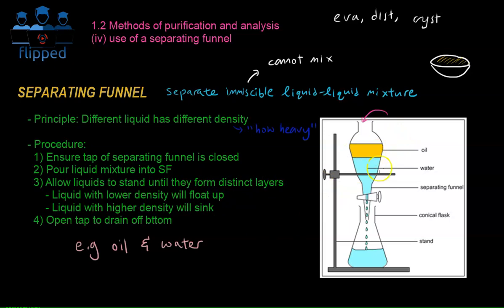So when you pour it in, it may not look so nice. It will just be a very cloudy mixture. Not say cloudy, but it's not distinct. But if you let it sit for a while with this closed, then this will actually form two layers. You can see it very well.